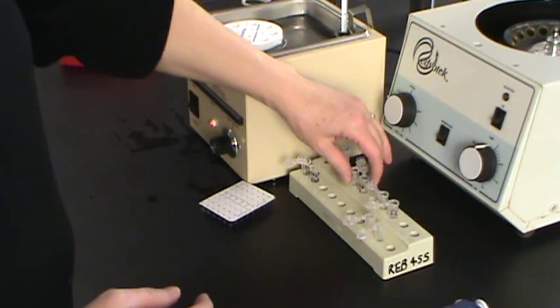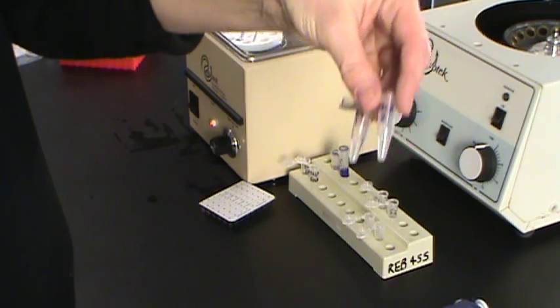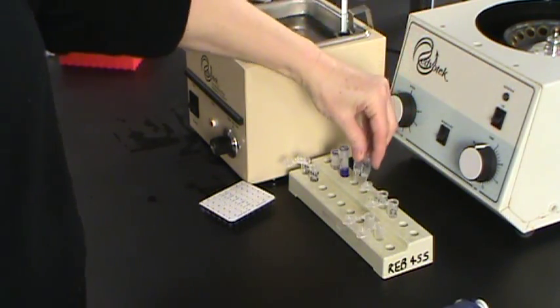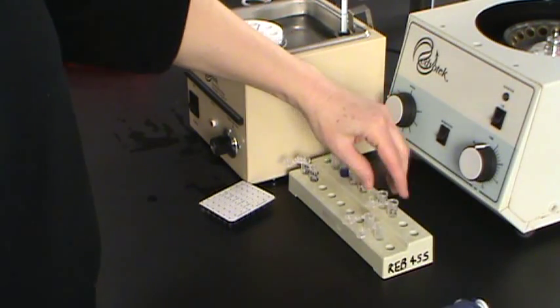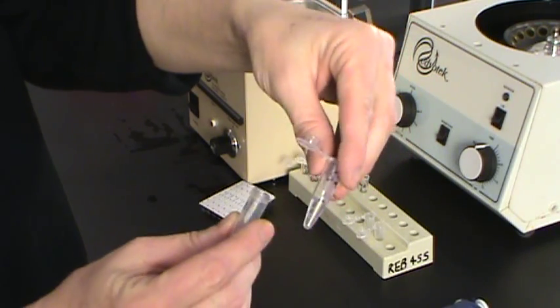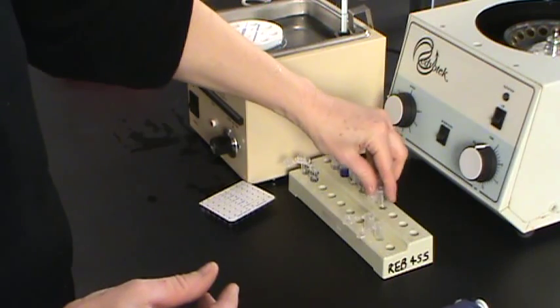You'll also have samples at your desk of the restriction enzymes, enzymes 1 and 2, and they will be labeled. You'll also have the suspect DNA, DNA 1 and DNA 2, that you'll be using.